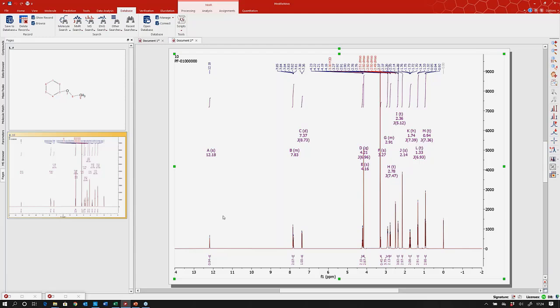And then if you're a large organization, you can use the enterprise flavor of the system to allow you to have many different databases set up for the complex user access, etc. But the fundamentals is that you can basically search into all the data that you have run in the past, and you can associate it by molecule or by sample number, and then easily find it by just searching from NMR, from mass spec features, from optical spectroscopy features, structure and substructure, as well as text searching.